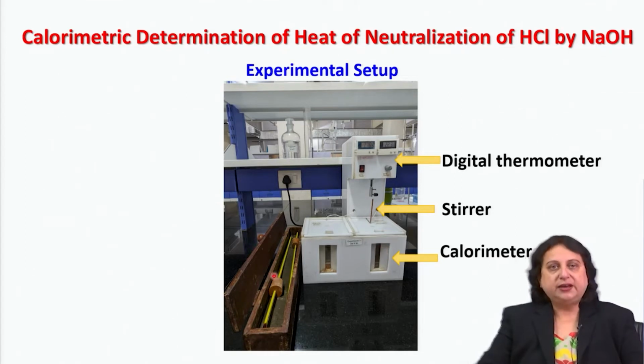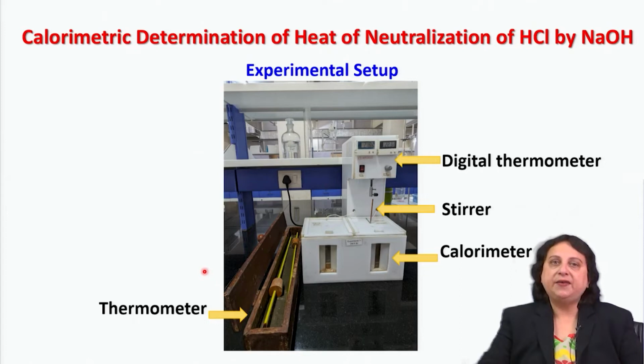And I would also like to bring to your attention that I have a set of thermometers, the normal thermometers, to perform the experiment.